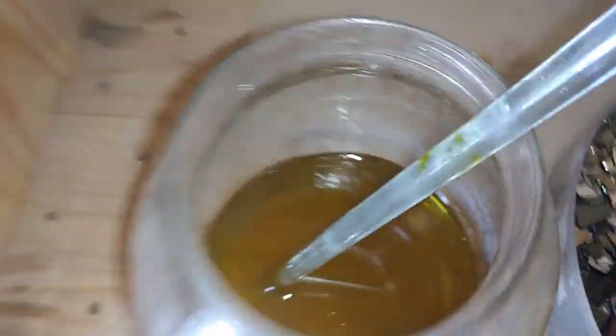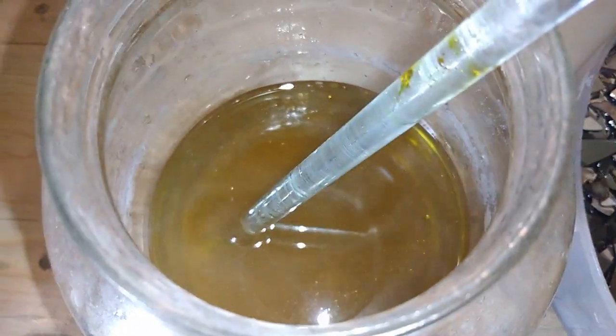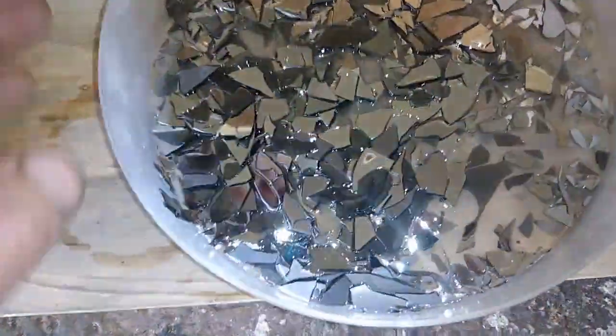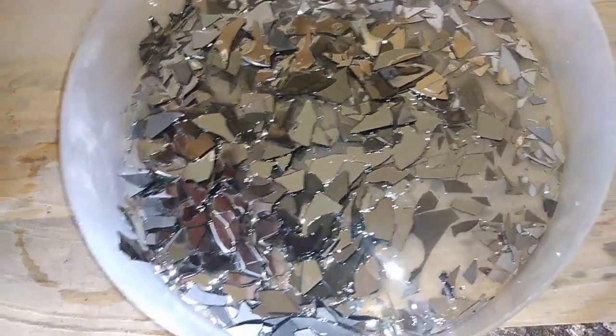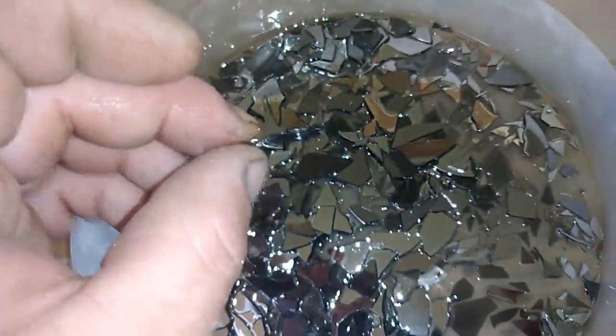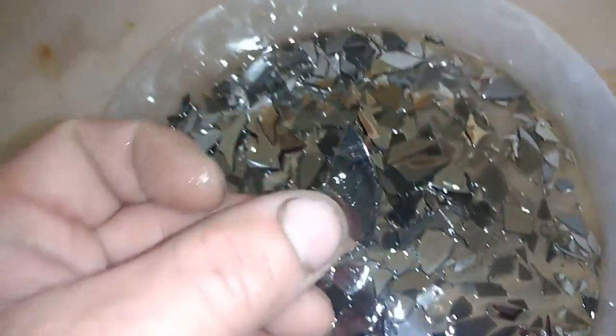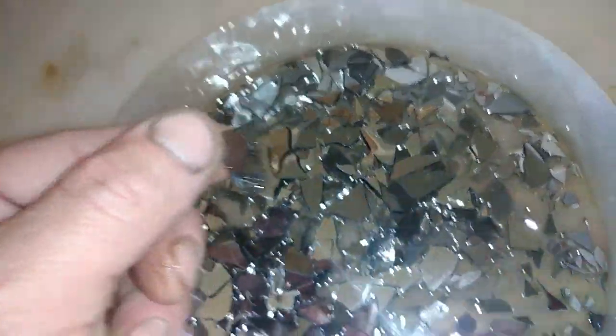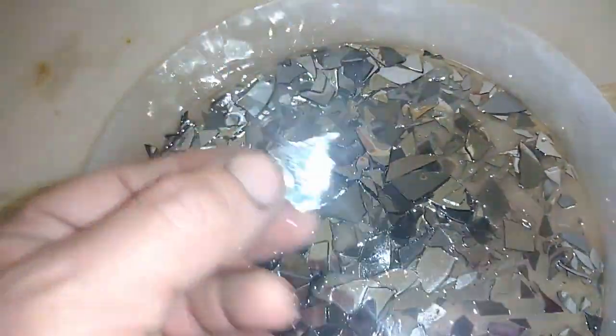So I transferred that solution — see that very nice color, shame there's nothing worth inside. This is after almost one month. I washed it a couple of times with water so no solution remains, and I just want to show you that almost 80% of all the discs still have plating. Very, very disappointing. But some of them, like this one — you can see it's transparent, so it's only glass now. But some of them still contain plating.